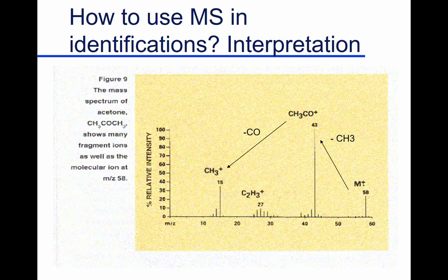How could you have normal butanol in two places in your identifications? There are no isomers of normal butanol. And he said, well, that's what the mass spec said. That was the best match. I said, that's not acceptable. It just isn't acceptable. There is a danger that you take what it gives you without sitting and thinking about it. That is dangerous, and that's how we get a lot of bad things in the literature that really aren't true, just from not thinking about what the mass spectrometer is telling you.